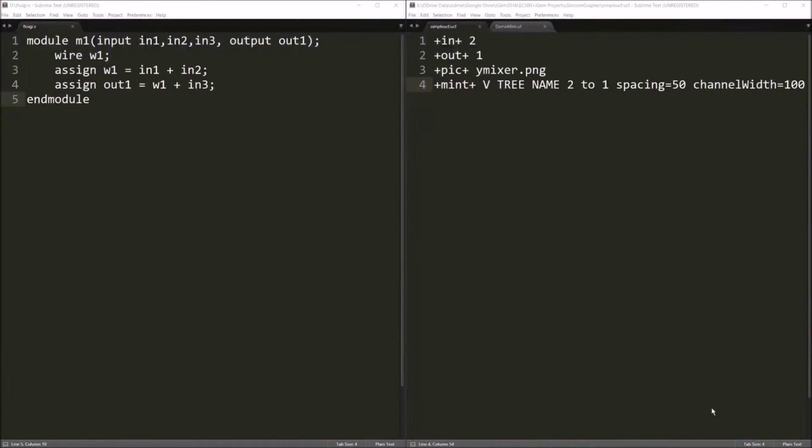Using this input method is beneficial to the user in that they will not have to instantiate their components each time they appear in their design. The UCF file can be treated as a library of sorts, in which, once a component is defined, the lab will never have to define it again. It is also beneficial that, other than for the one-time device instantiation, the user will never have to write mint code.